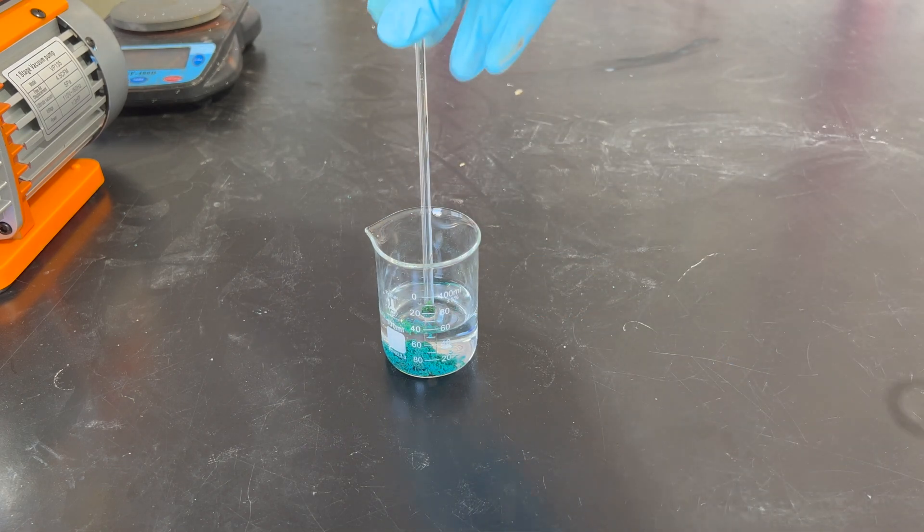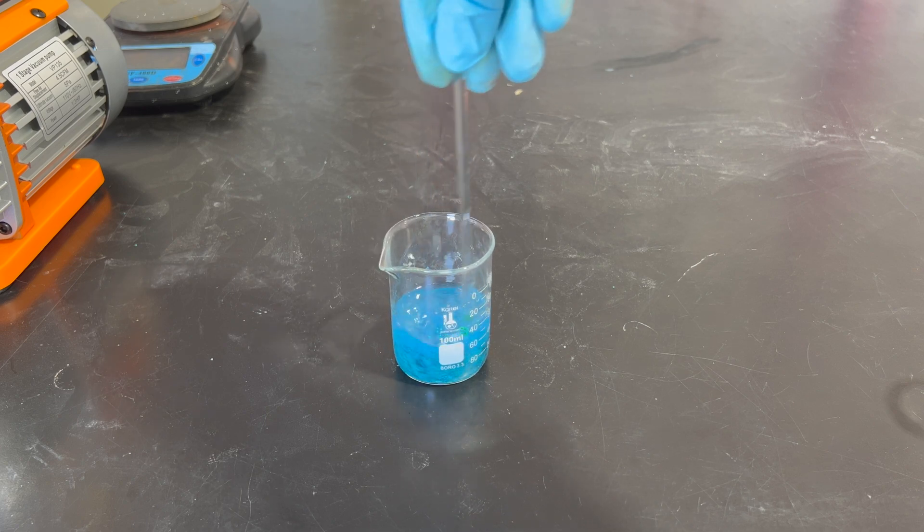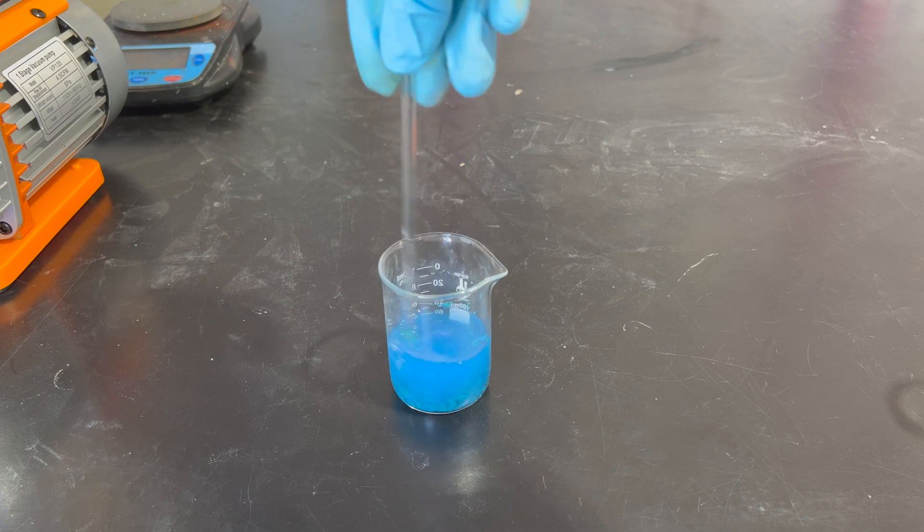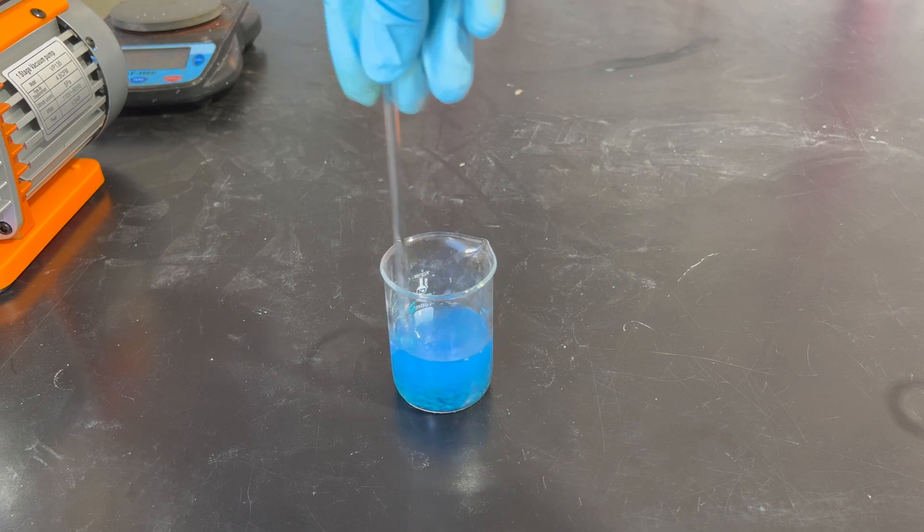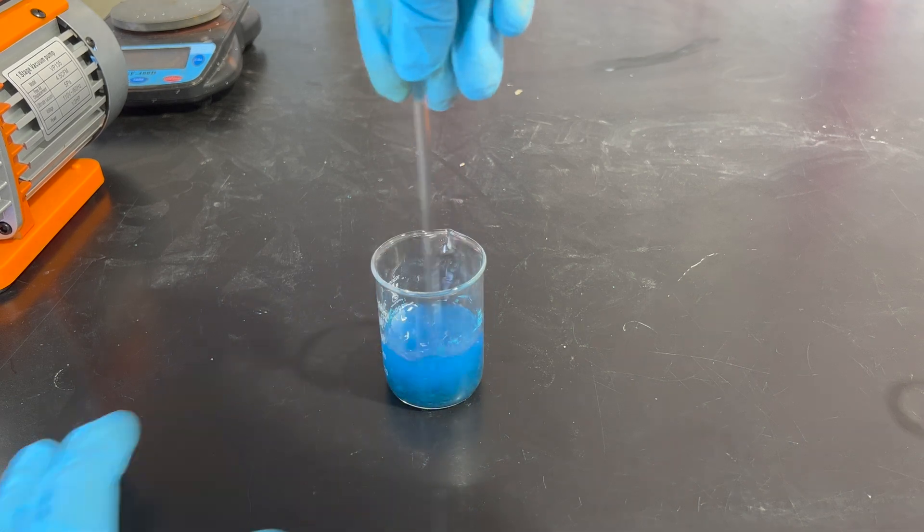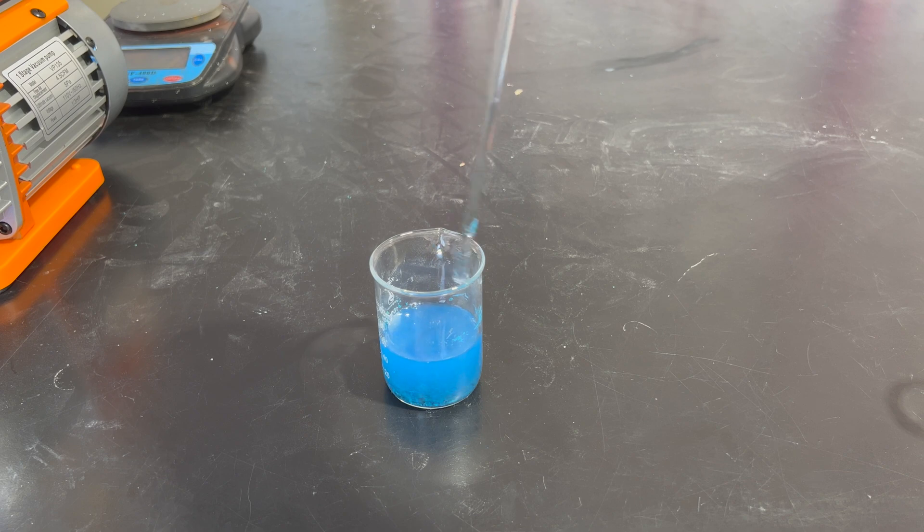We'll be using a vacuum filter for this. We'll start the solution around to make sure that all the copper 2 chloride reacts, and also it creates a really pretty blue solution. This is the color of the copper hydroxide, which, as you can see, is very beautiful. Now that we're done stirring it for a bit, we'll move on to the filtration.